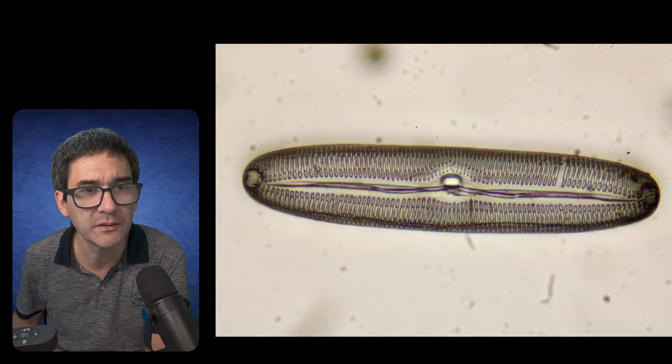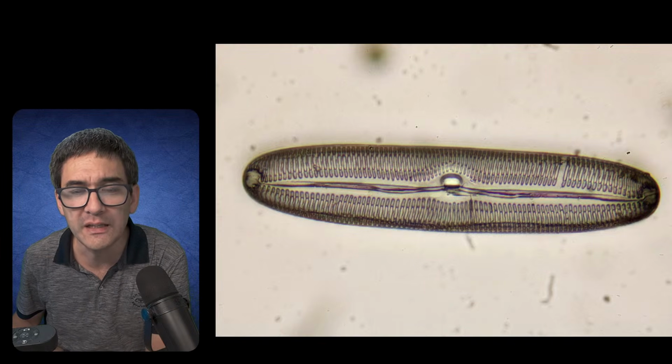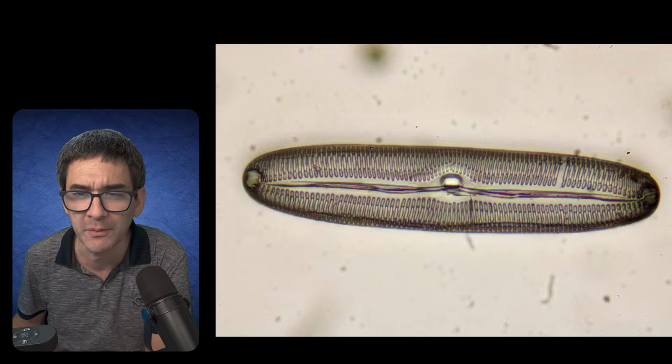Let me quickly check. Yeah, I can read the email from Mike. I believe the attached image is a freshwater diatom from a local pond here in Connecticut in the United States. I find lots of them in my water samples, but this one looks exceptionally interesting. Yes. And no, I don't know if it's focus stacked or not.